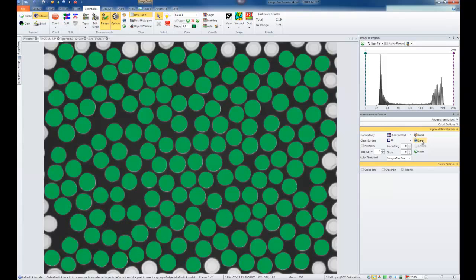Lastly, if you want to load or save these options, this is the place to go. Segmentation options can be very useful and should be saved with as many experiments as possible. If you need to reset all of these options, that option is available too.